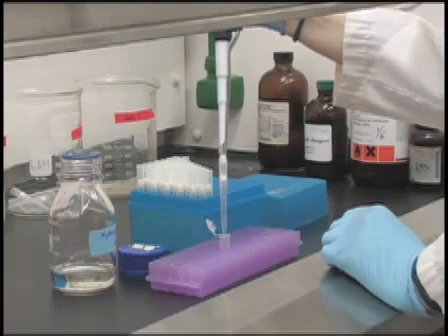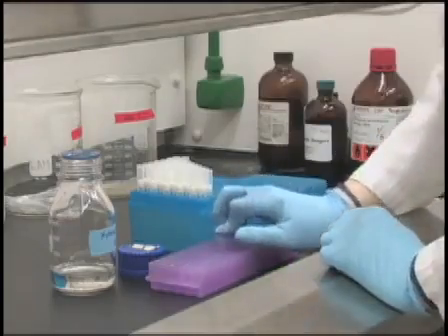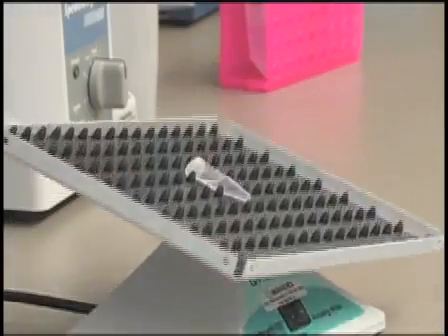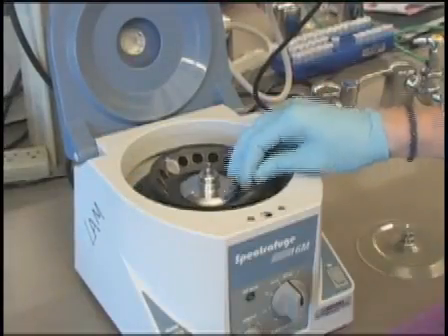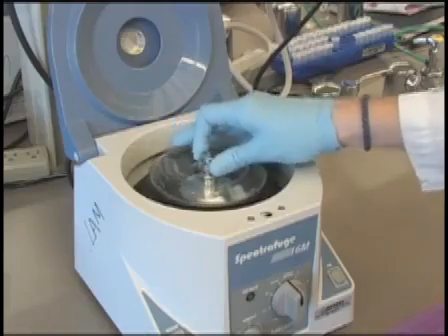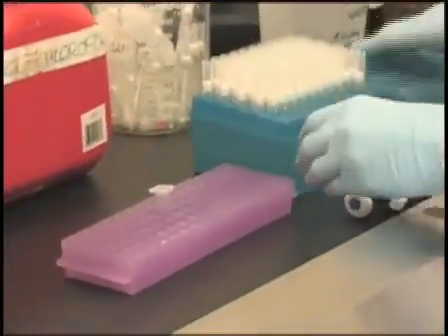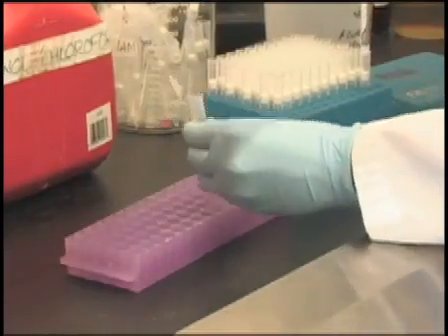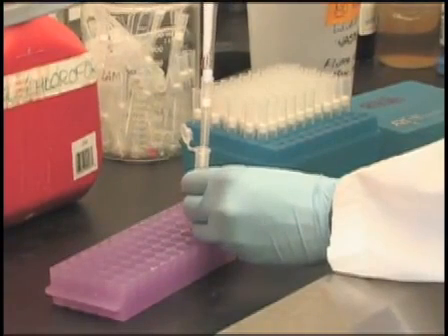Add 800 µl of xylene to the tube containing your sample. Then place the sample on a rocker for 10 minutes with gentle shaking. Spin down the sample at 14,000 rpm for 3 minutes to pellet the sample, and then remove xylene and dissolved paraffin from the tube.